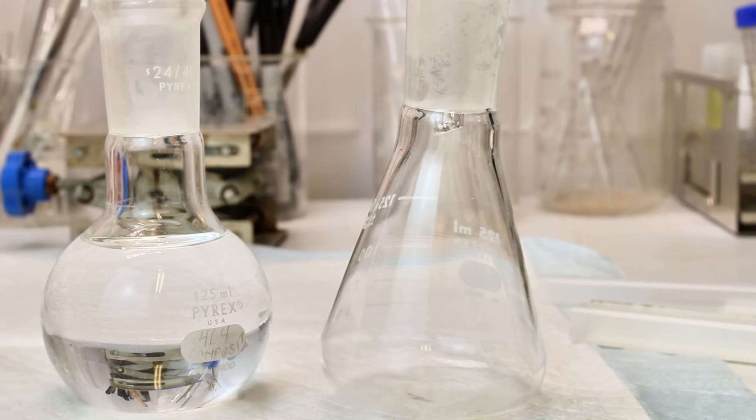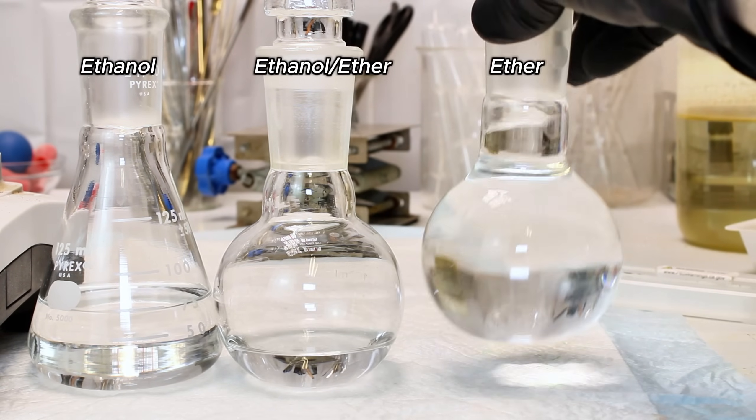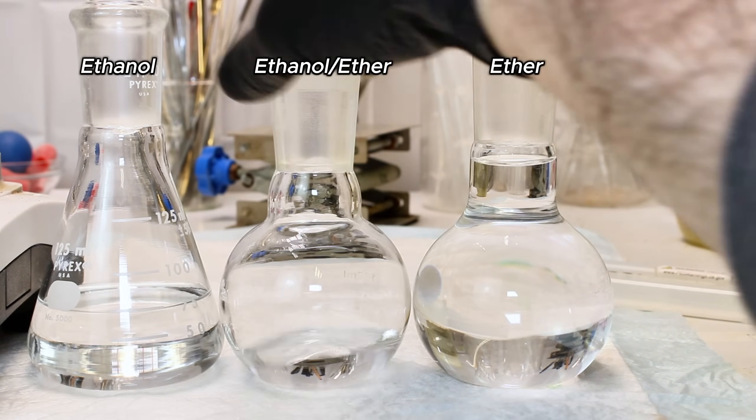I then switch out my collection flask one final time and collect everything under 80 degrees celsius, which should be mostly ethanol that I can reuse for making more ether.